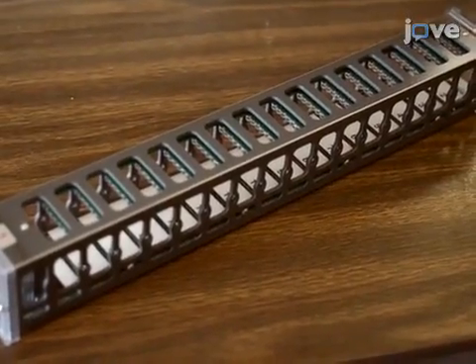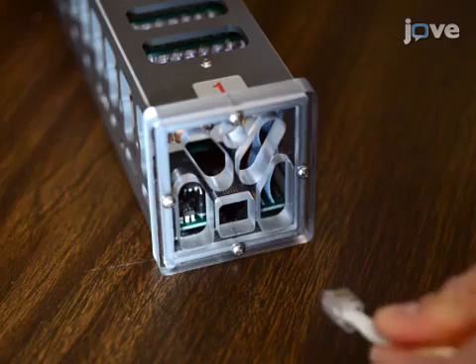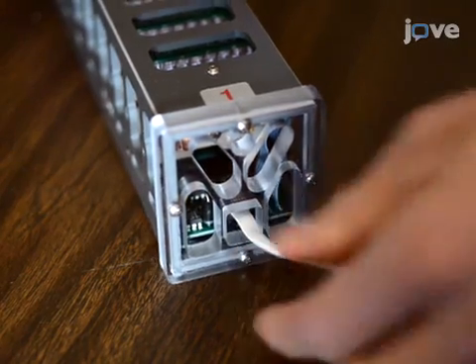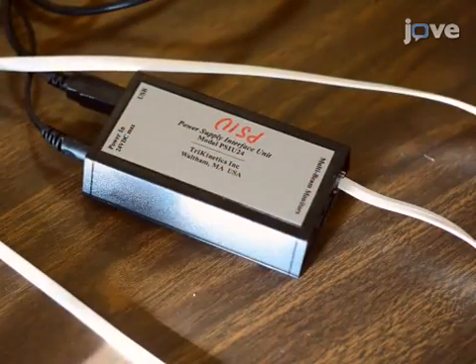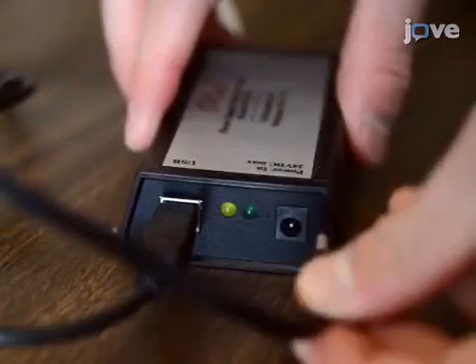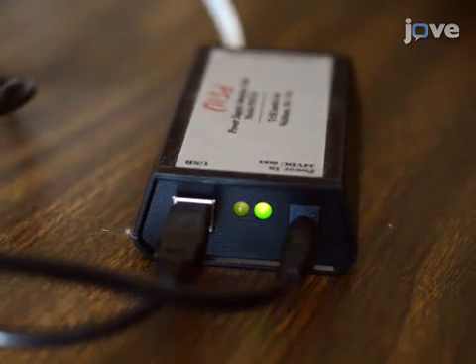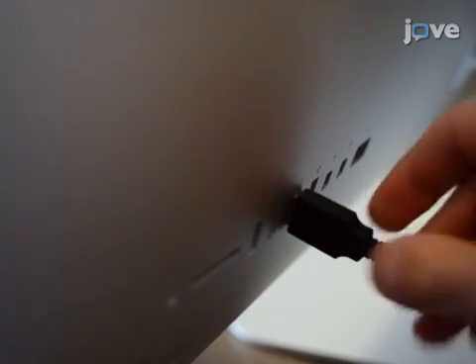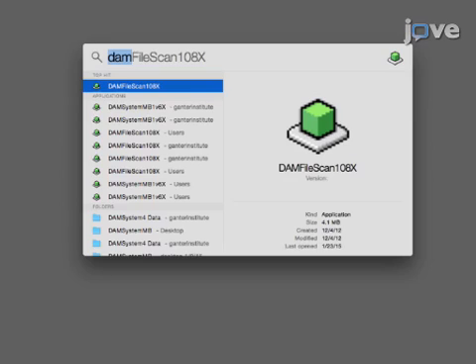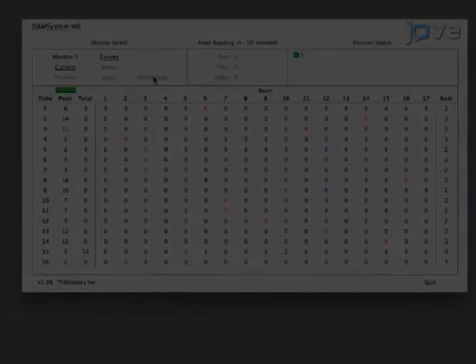This protocol uses an MB5 multi-beam Drosophila Activity Monitor device, or DAM. To set up the DAM, first connect the monitor to the Power Supply Interface Unit, or PSIU, using a CAB6 telephone cable. Then connect the PSIU to a power outlet — a green light will indicate an appropriate connection. Third, connect the PSIU through a USB cable to a computer for data recording. Now install and open the DAM System MB1 v6x program on the computer. When the software is opened, it automatically starts recording data in the software control.